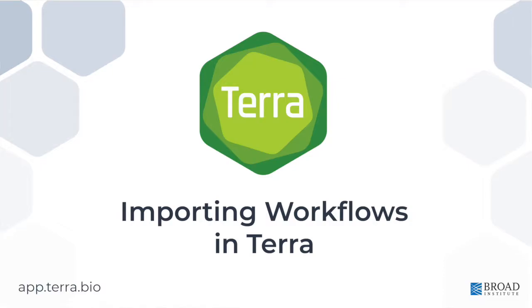Hi, this is Anton from the Terra team. In this video, I'm going to show you how to find ready-to-run workflows or publish and import your own workflow scripts to use within Terra.